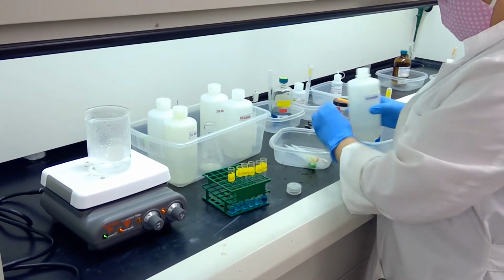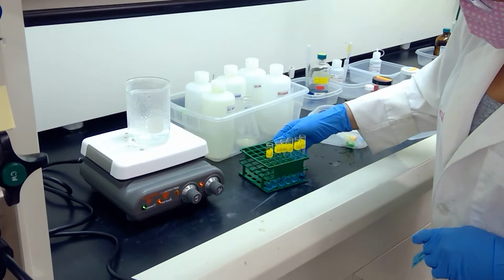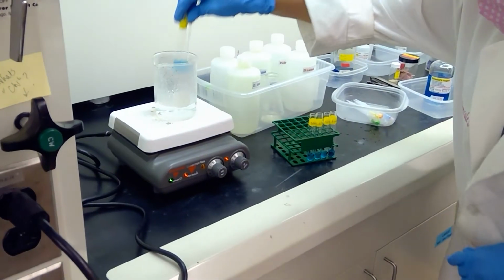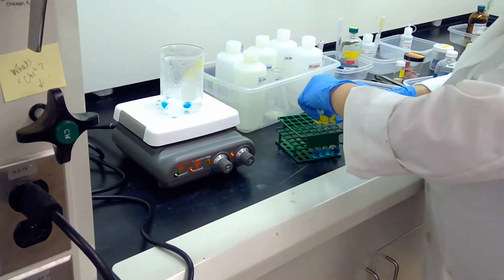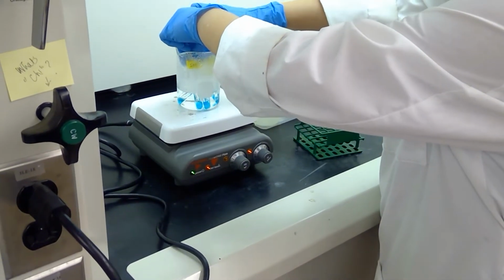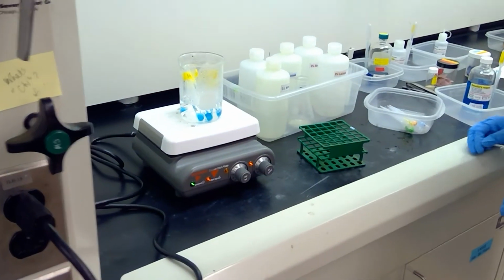Okay, now that we have all of our samples in our test tubes here, we're going to put them into our hot water bath and see if we happen to get a color change. All right, so I'm going to lay these into the water bath gently. Okay, and we're going to wait a few minutes to see if we get any color change.